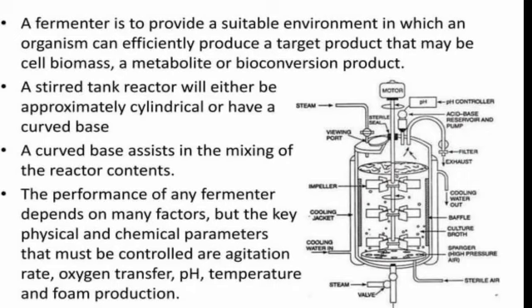If the agitation is more, my cells might get ruptured. Oxygen transfer has to be optimal. A large amount of oxygen is difficult to handle, and if the cells get less oxygen, they would not grow either. The pH also needs to be optimal. With higher or lower pH, the acidity of the whole matter needs to be maintained, otherwise the cells would again get ruptured, or they might shrink or swell, and plasmolysis might occur.